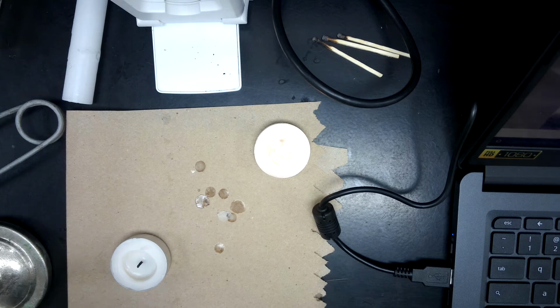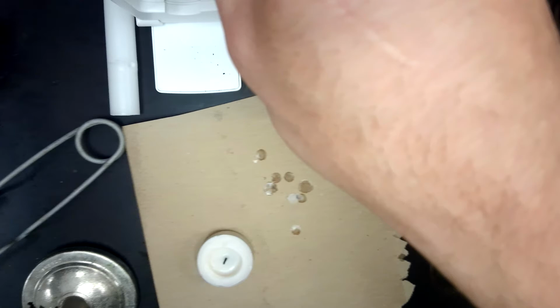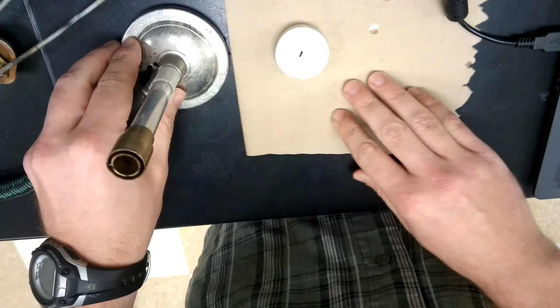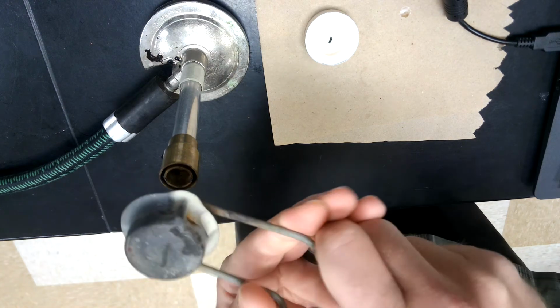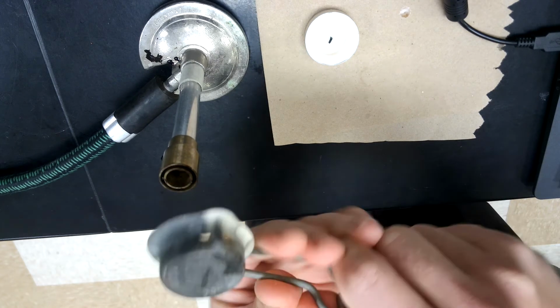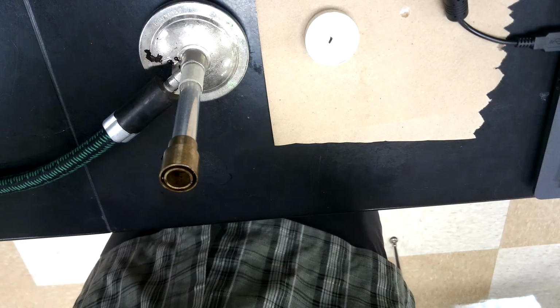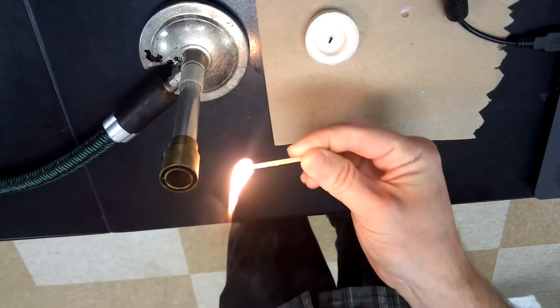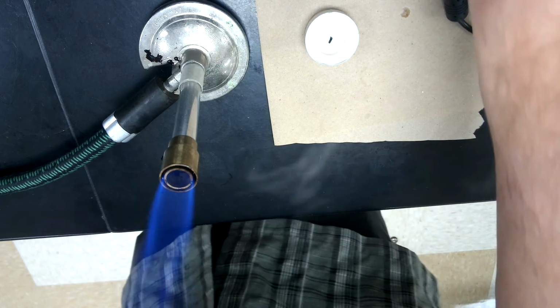I'll just go in order here. I'll turn on my fire. Station number 2 asks you to use the Bunsen burner to light some steel wool on fire. So you'd get to use the Bunsen burner normally. Let's see here. I'm not as good with the flint striker as I am with the matches, apparently. I'll just switch over to a match. Always light a Bunsen burner from below if you are using the match method. That way you don't start anything unnecessary on fire.